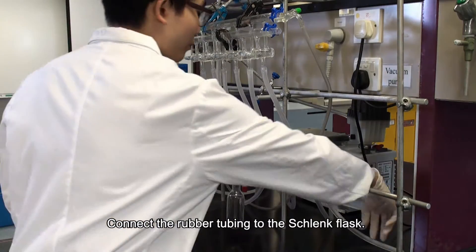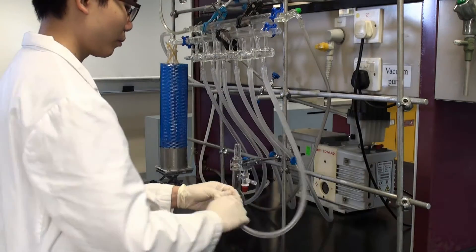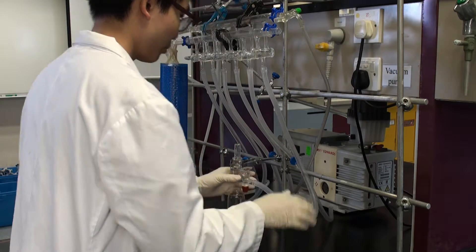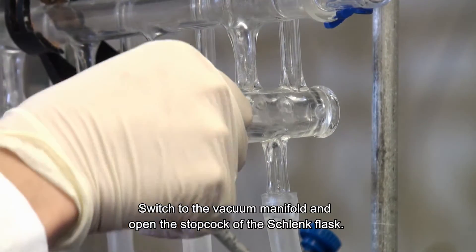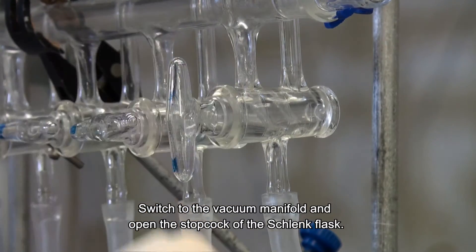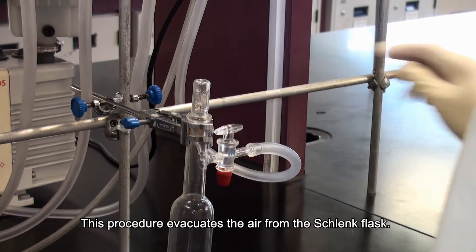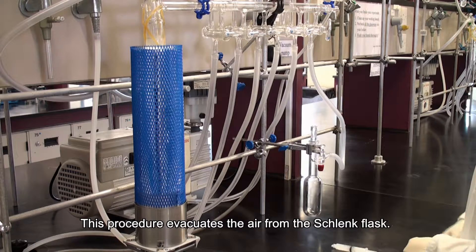Connect the rubber tubing to the Schlenk flask. Switch to the vacuum manifold and open the stopcock of the Schlenk flask. This procedure evacuates the air from the Schlenk flask.